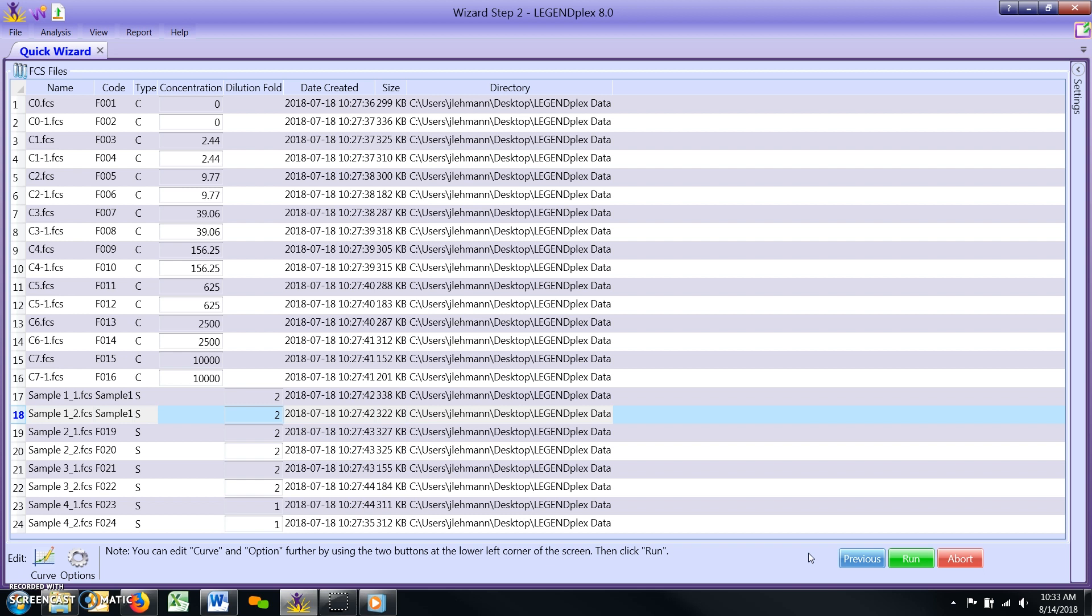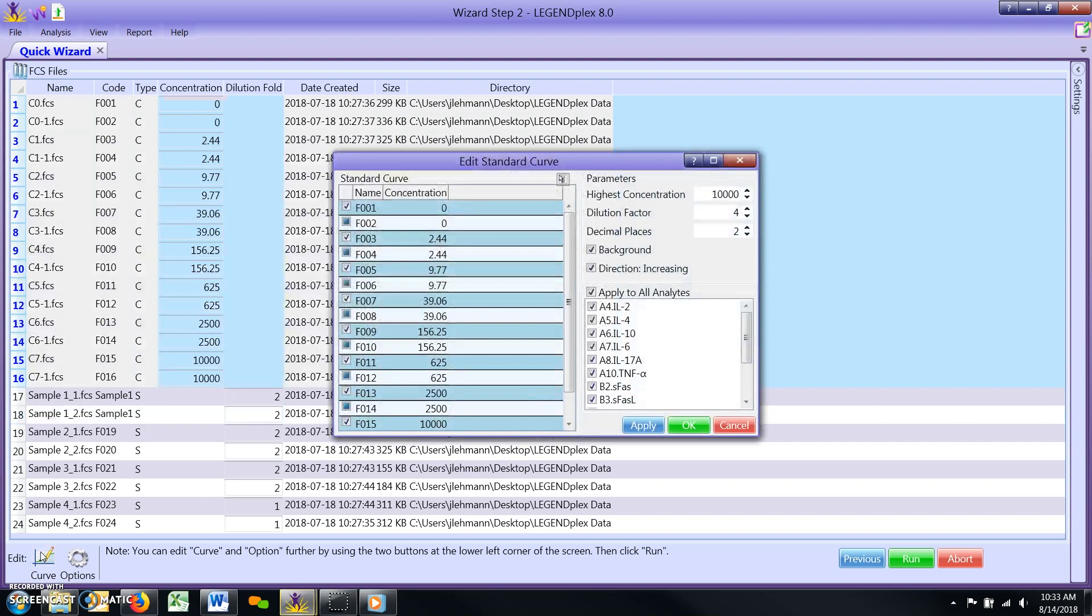If you need to adjust the concentration for a particular analyte target, this can be accomplished by clicking the curve button that is now visible in the lower left corner of the screen. This will open the edit standard curve window.